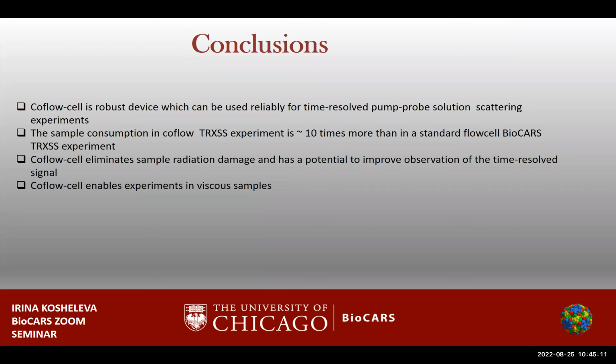Actually, I have one. This is Cynthia Stoffaker, Irina. Lovely talk. Thank you. I have a question. This is set up very well for laser pump probe sort of things like that. What about, is there any future in the CoFlow cell for things like pH jump? I understand the problem with mixing and the rest of that, but what do you think?